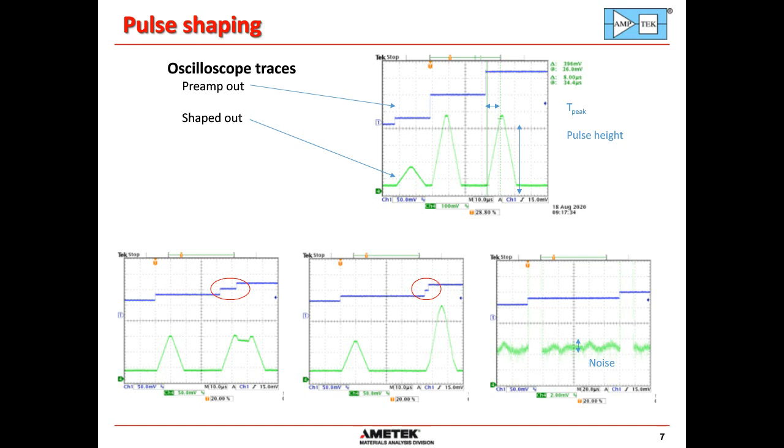But if you take your unit out of the lab and put it in the field, we've got systems used in factories where temperatures could be 40 degrees C, and the ambient's 40. It may be hotter inside your instrument box, 45, 50 degrees C, and at that point, the detector does not reach as low a temperature. That's why, for stability, we recommend raising the set point. Within our signal processors, you can command it to go to a particular temperature. If you set it to 200 Kelvin, it won't actually reach that. That simply means the cooling circuit is always driving as hard as it can. If you back that off to say 230 or 240, the resolution loss is negligible and you improve stability, as gone through in several of the slides.